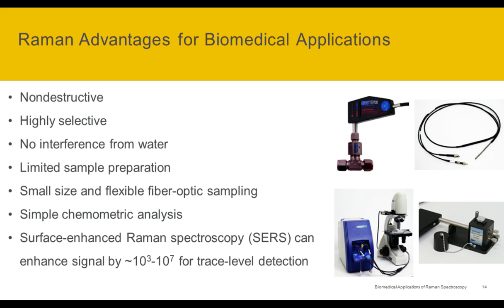So I think this is going to be really important going forward because the trend in biomedicine is going more and more towards portable analysis and really looking for simple solutions that can be applied at what's called the point of need. So this might be either a clinical setting or an operating room, but this idea of portability is going to be really important moving forward.